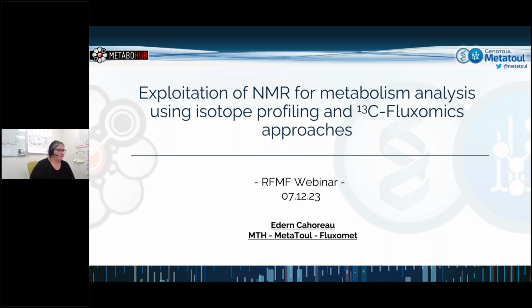Thanks a lot. Thanks for the introduction, Amandine, and thanks for the invitation. So to change a bit, I will speak about NMR. If there are any more NMR people, please stay here. MS people too. So I will speak about C13 fluxomics, and especially a few developments that we did on the platform over a few years.